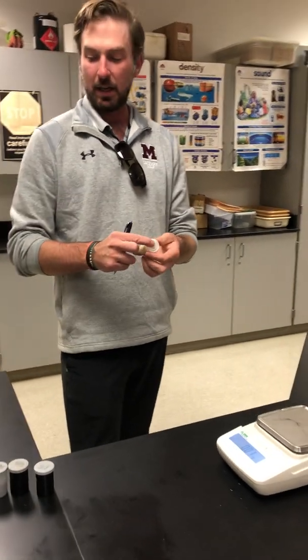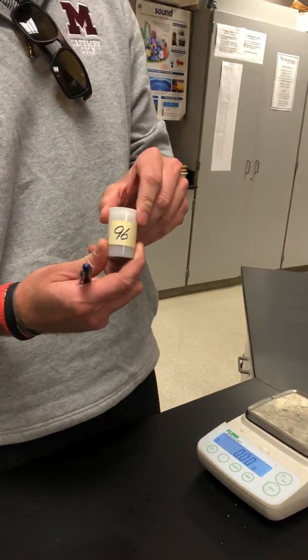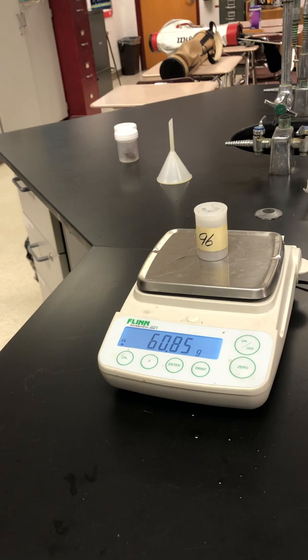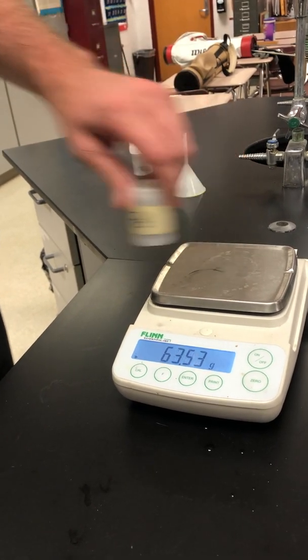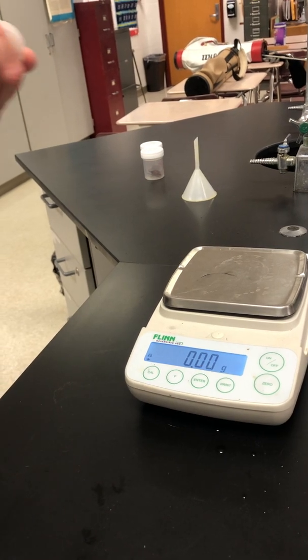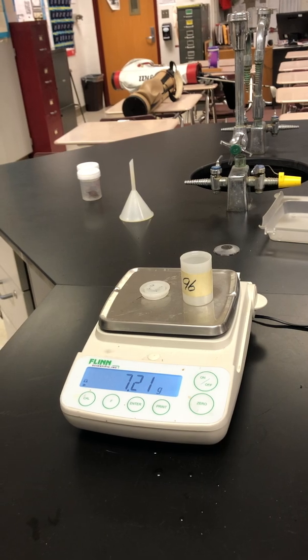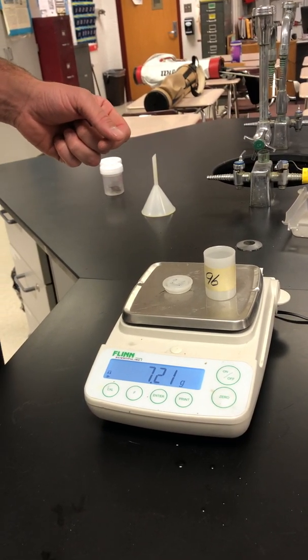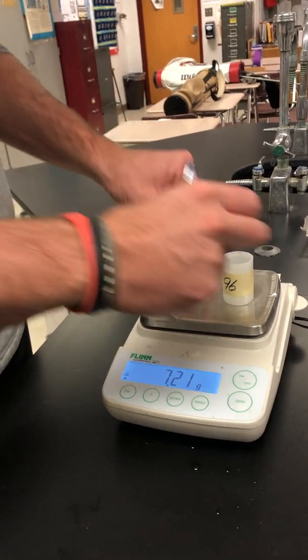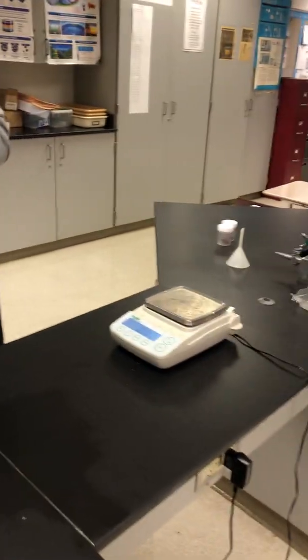Last name's E to H. You guys are going to have container 96. The container with the pennies weighs 60.86 grams. And the container on its own has a mass of 7.21 grams. Nope, 2 grams. Nope, 2.1. A little airflow is changing that last digit on this balance.